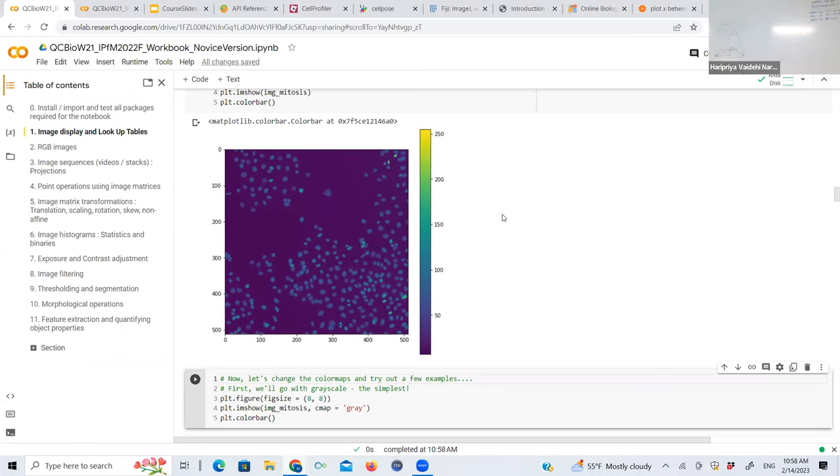It could be, I think, the density of the chromatin. Yes, I think the paper from which this image was taken is actually pretty well known. It's a Cell paper from 2016, but it's usually the chromatin density that corresponds to intensity. Possibly, yeah. And I do think I've seen papers where people try to map out density within the nucleus to the processes that are going on there. So that's a really good point.